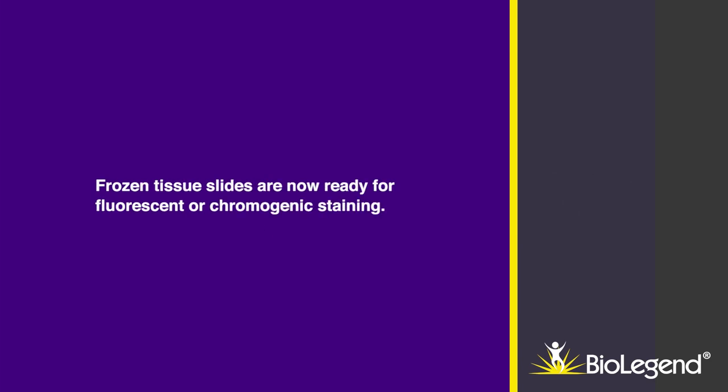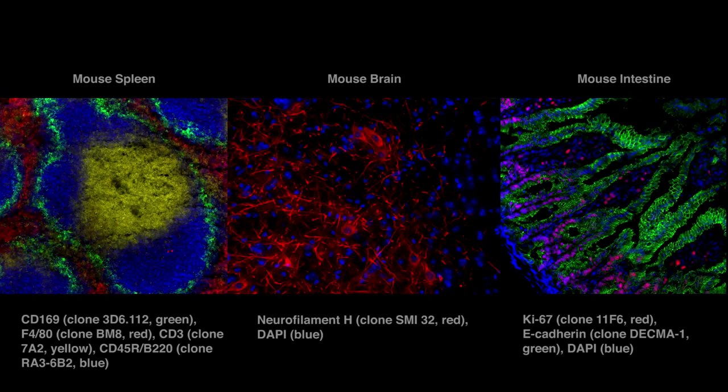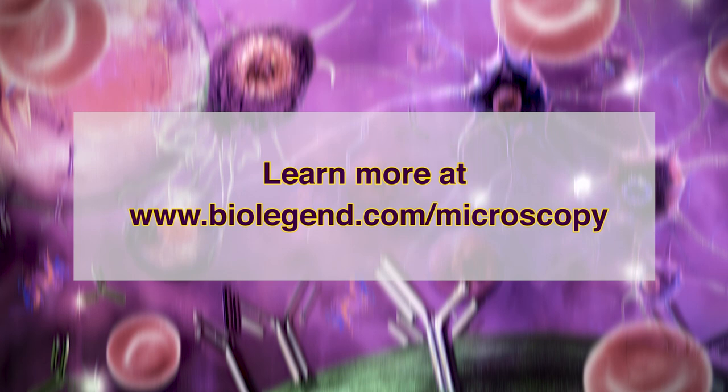Frozen tissue slides are now ready for fluorescent or chromogenic staining. Learn more at www.biolegend.com/microscopy.